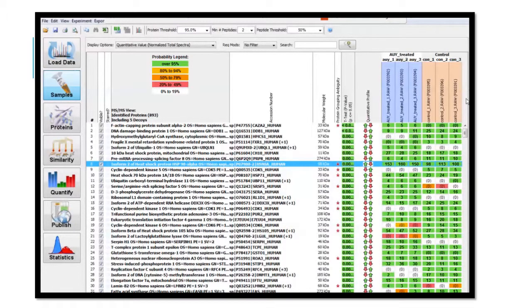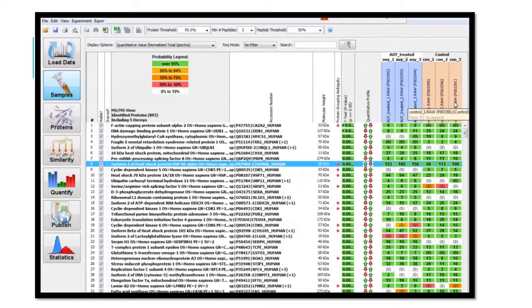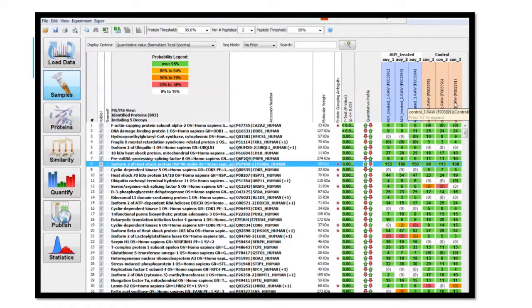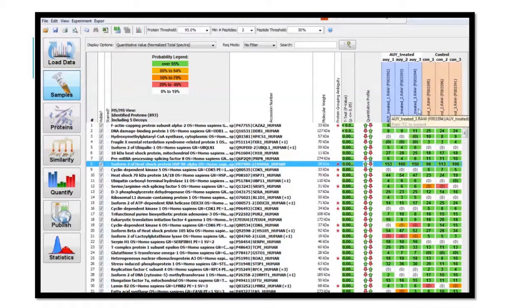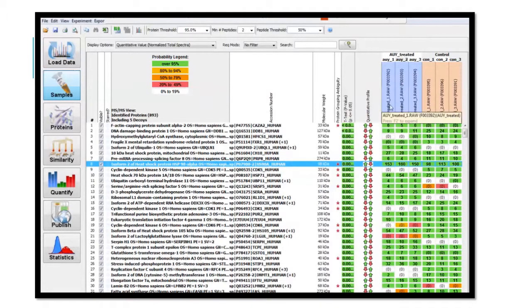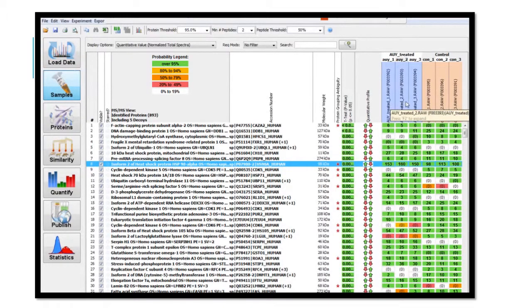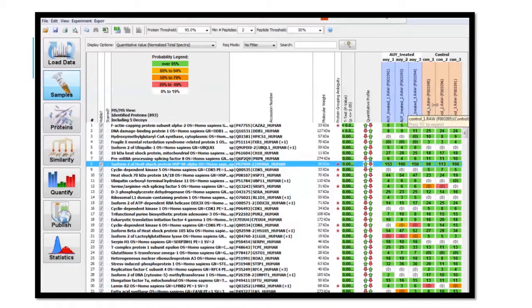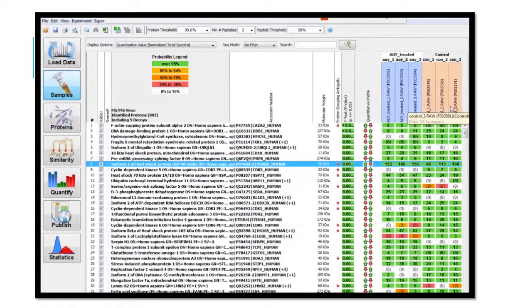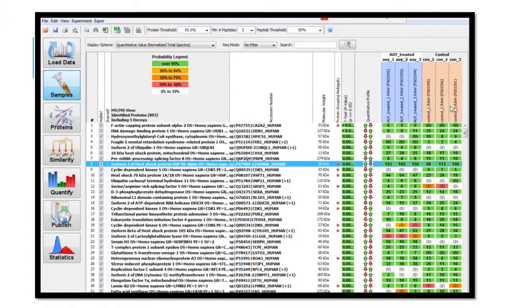What you will do is compare a selected protein whose expression is statistically changed with treatment with AUY922. Note that there are three columns for each, the treated cells and the control cells. This tells us that the experiment had replicates.